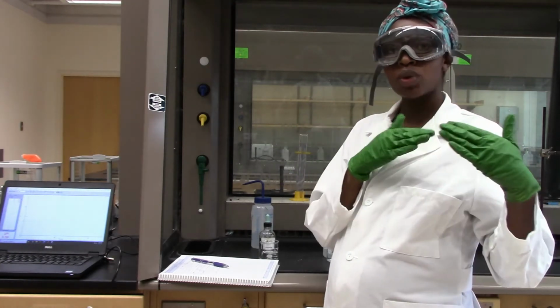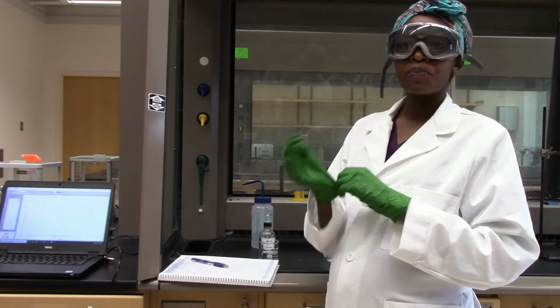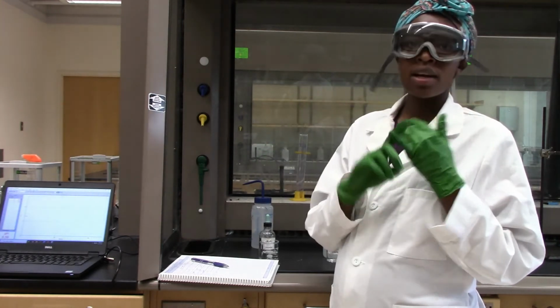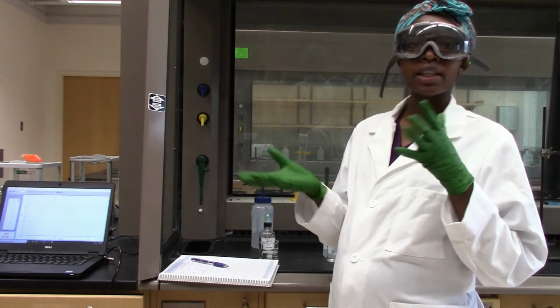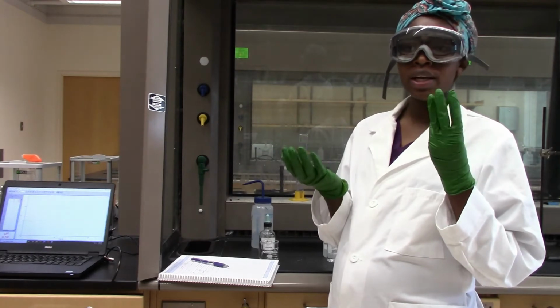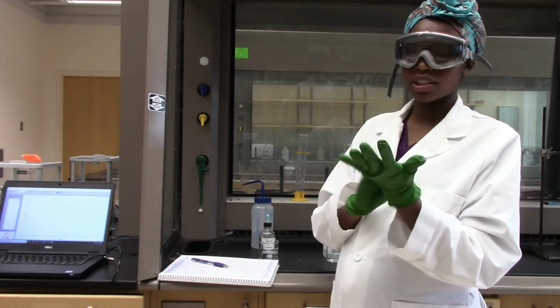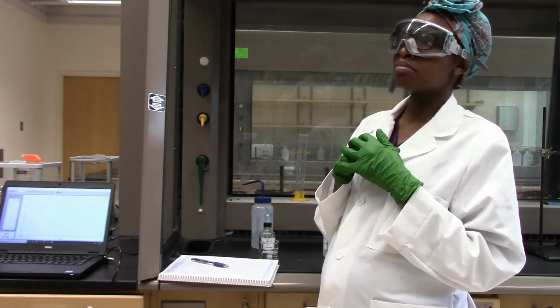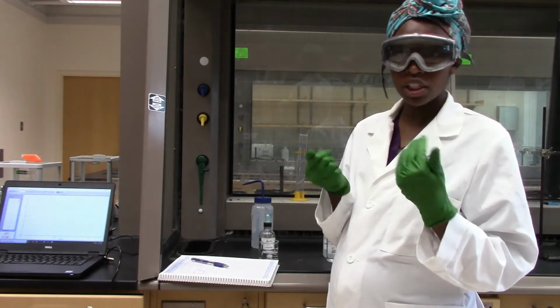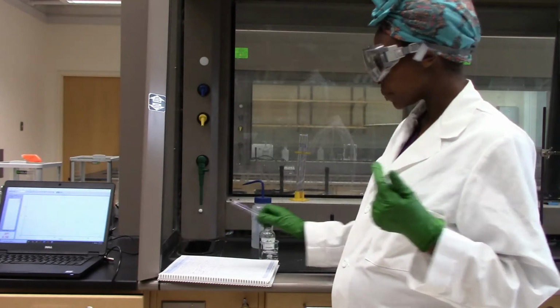We have a point where we will do titration, and in titration you're basically adding a base to an acidic solution, and you expect that they will neutralize, and when the pH indicator changes color, then you know that the titration point has been hit. So let's begin by looking at the effects on the pH of a buffer and of deionized water.